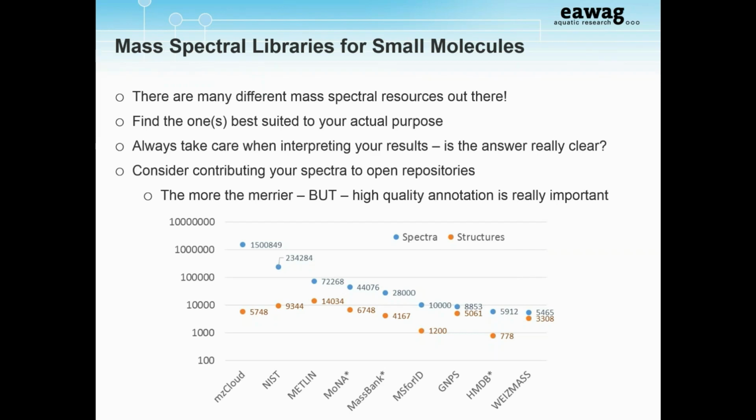This depends. So we've developed RMassBank. This works extremely well for the Orbitrap spectra that we developed it for. And if you have the acquisition and everything correct, I think WiseMass used a very similar approach. What you can now do is measure in mixes and start off with a list. It takes you a little while to get to know the software, but if you're comfortable in R, you can have a couple of goes, and then once you know it, it will effectively run in the background. So you have quite a high learning curve, you have to learn quite a lot at the beginning. If you learn that, then you can manage to do hundreds of spectra, or even thousands.